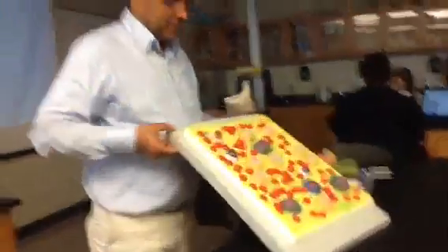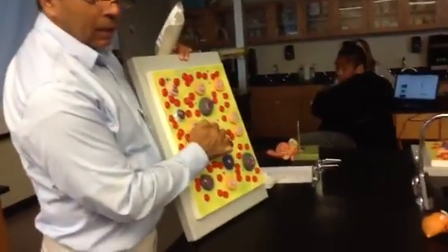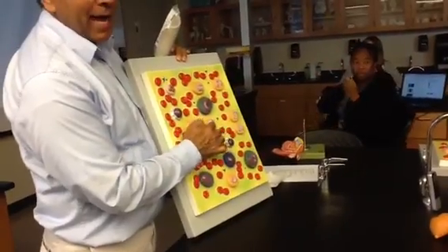Please identify eosinophil. It has orange-red granules. So eosinophil is this guy. Orange-red granules.